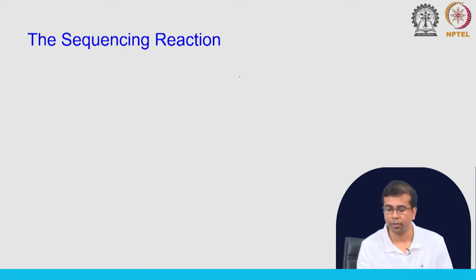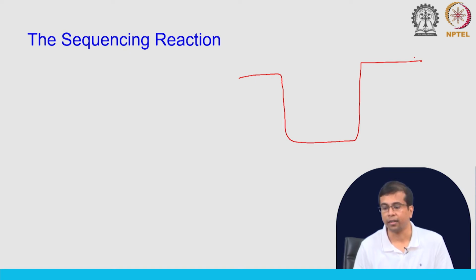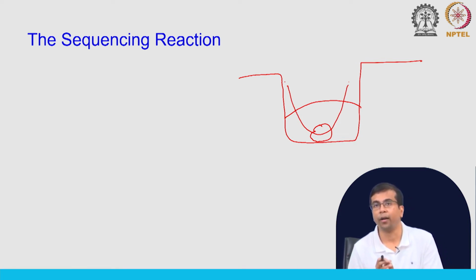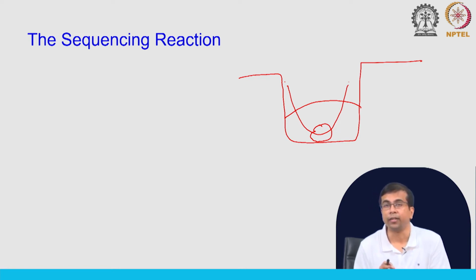As I mentioned, we have the ZMWs, and this is where the sequencing is happening. The lower part is illuminated, and inside this ZMW you have the DNA polymerase sitting at the bottom of the well, and it then binds to the DNA molecule that comes in. Of course, you would have to ensure that one polymerase gets only one type of DNA molecule. This can again be optimized through trial and error. Now, once this DNA molecule comes in here, along with the adapters, you can start the synthesis process.